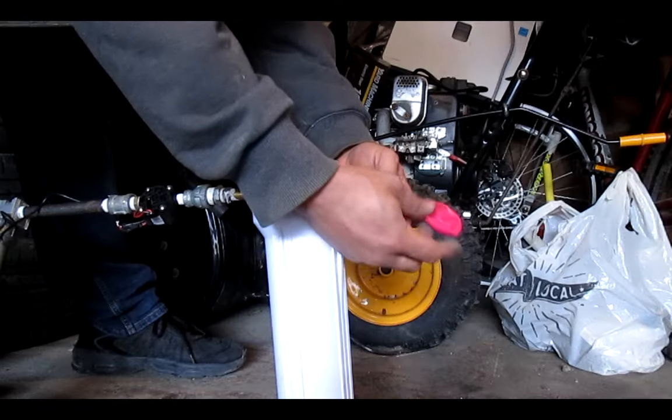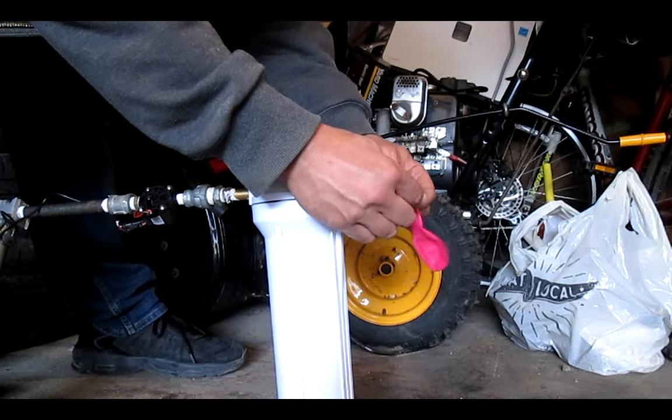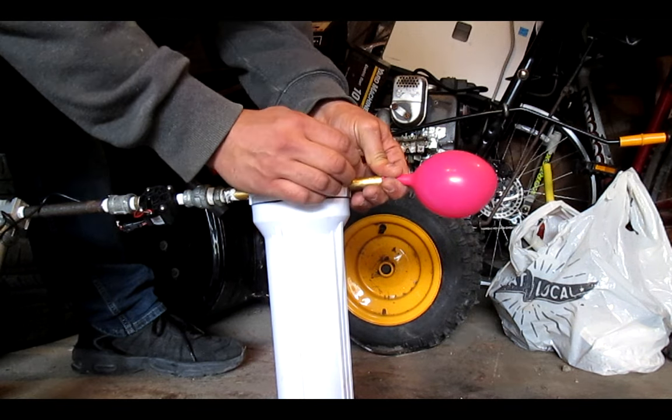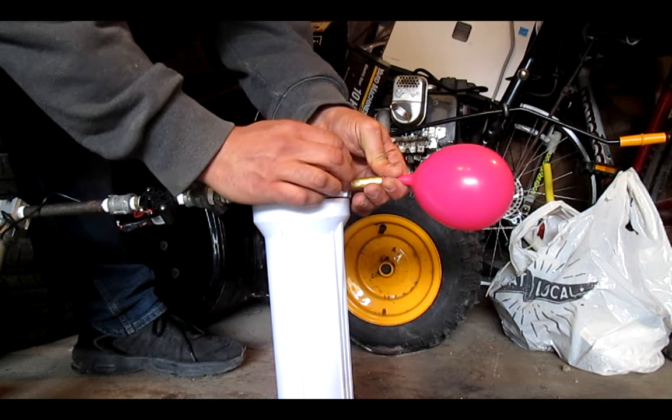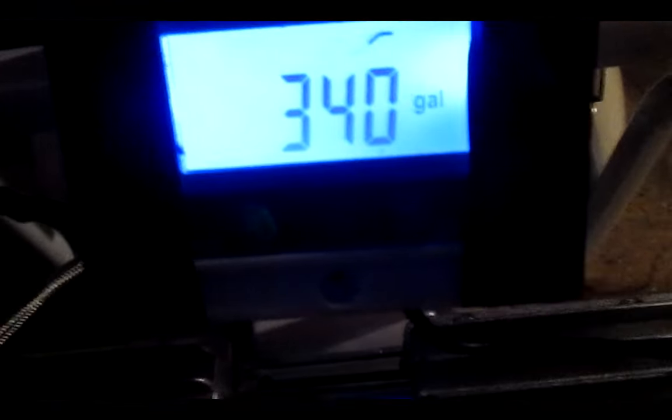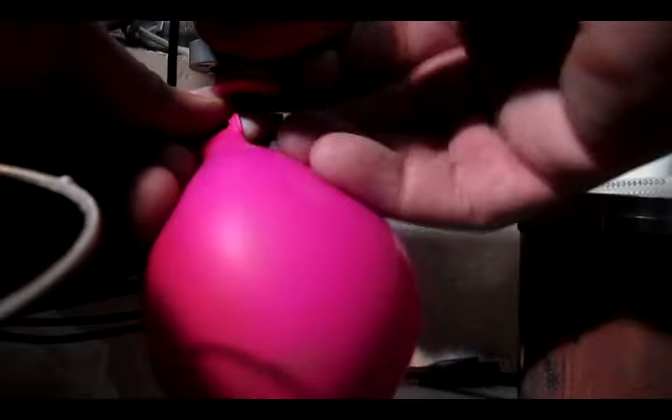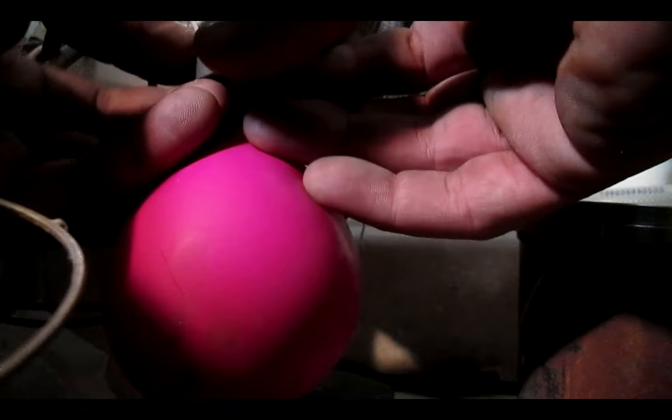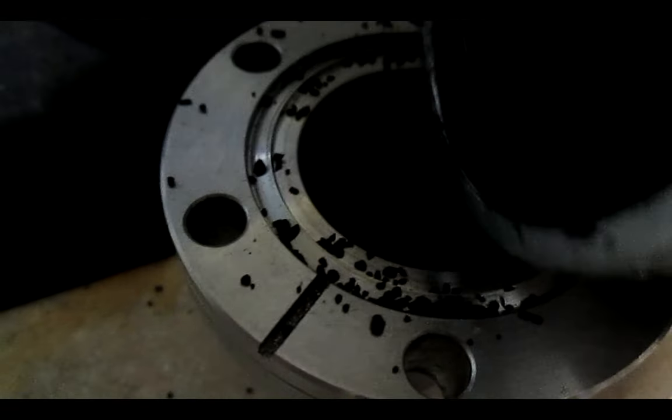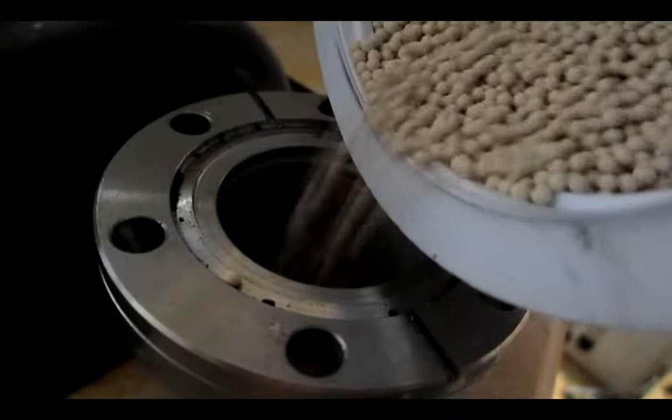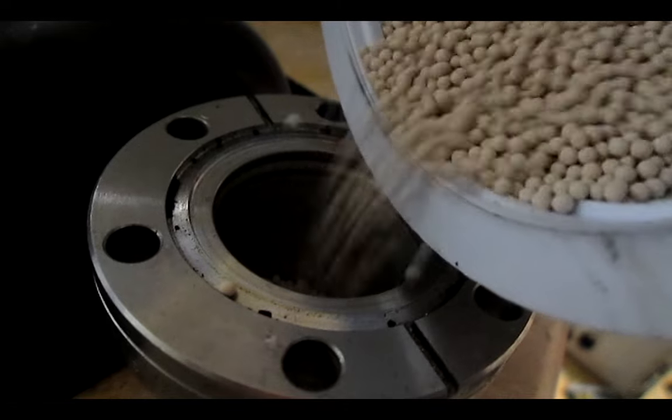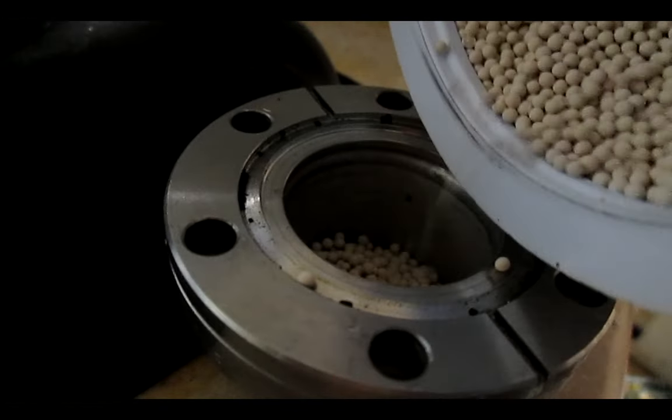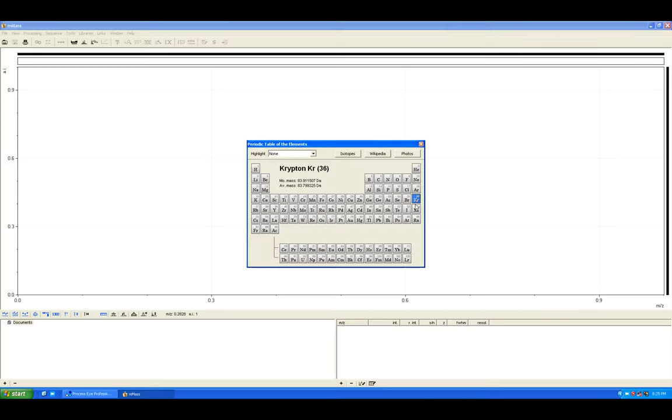Anyway, I let the compressor run for a few hours, collecting and analyzing air samples until 340 gallons passed through, or about 1,285 liters. I then recovered the activated charcoal and molecular sieves and heated them to release whatever had accumulated.